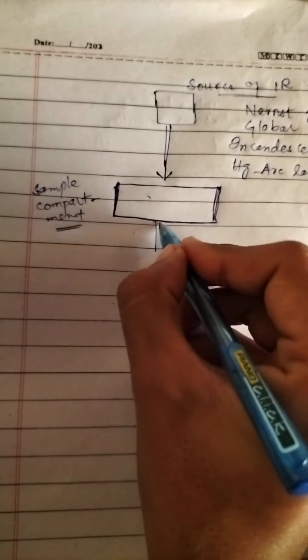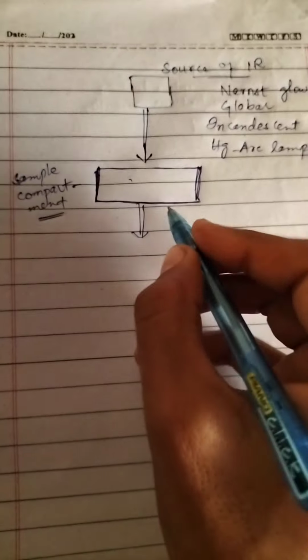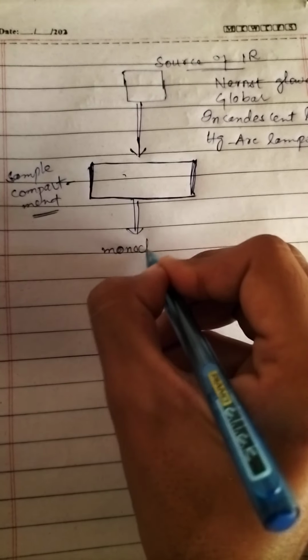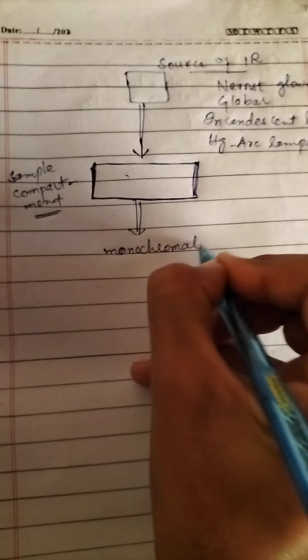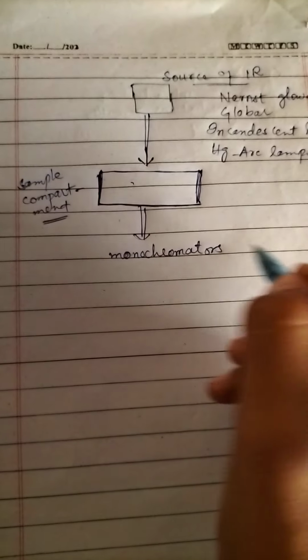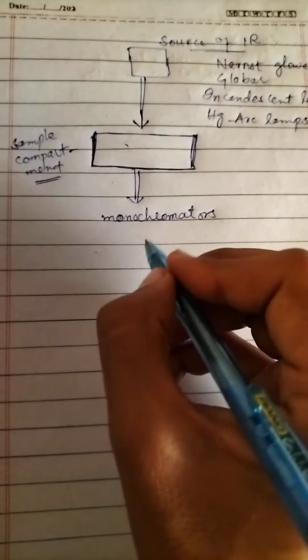After the sample compartment, there are the monochromators. Prisms or diffraction gratings can be used.